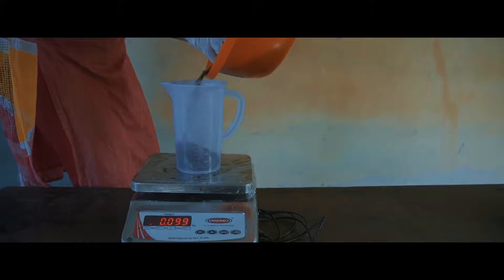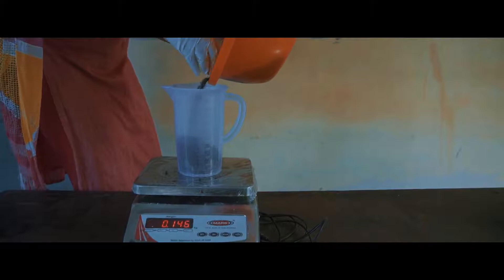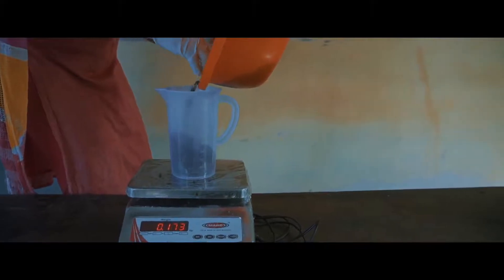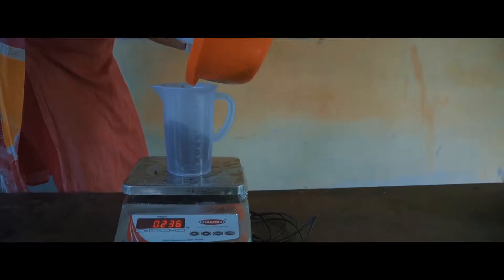Tare the empty measuring jar and fill the dried black pepper up to the 1 litre mark. Weigh it on the weighing scale. The weight in grams is its approximate bulk density. Please follow the recommended practices so that your pepper has maximum bulk density and gets you a higher price.